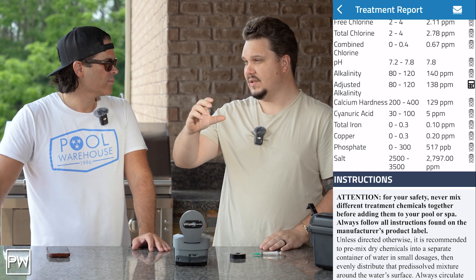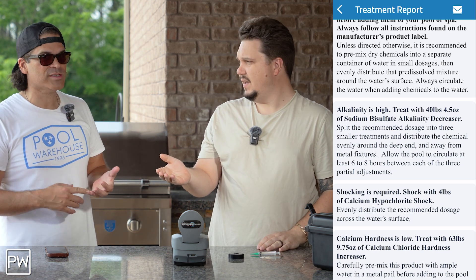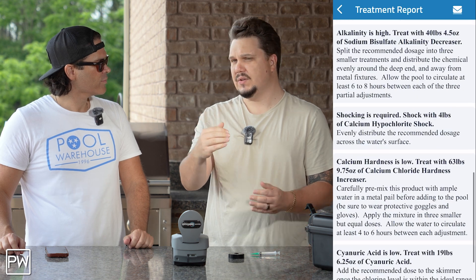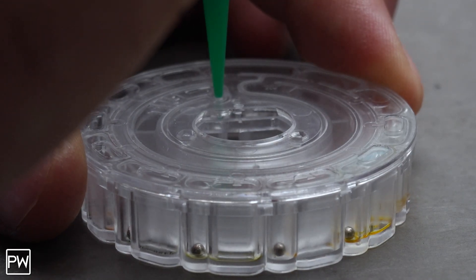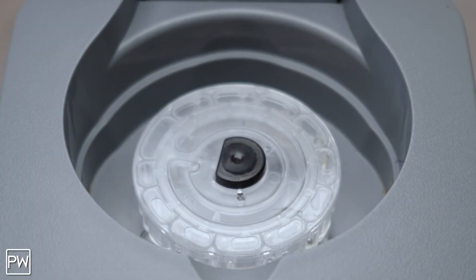It'll give you not just the readout of all your tests, but also on the app you'll plug in your pool type, all the equipment on your pool, and the volume of your pool. Based on those things you set — whether you're using salt or chlorine — it'll actually tell you, based on those test results, you probably need about this much pH minus or this much alkalinity plus. It'll tell you all the things. Getting the reports is really easy; it spits out everything you need to know.